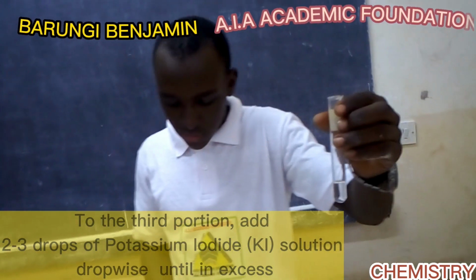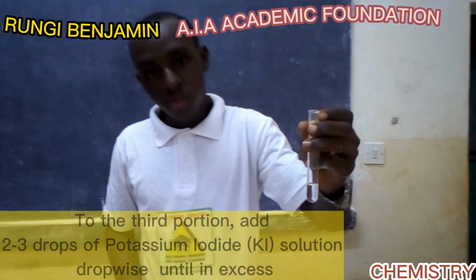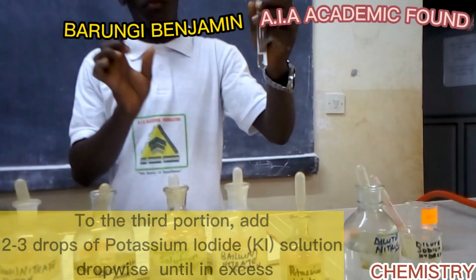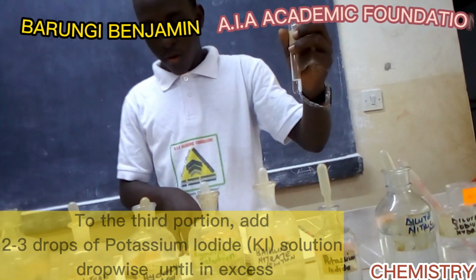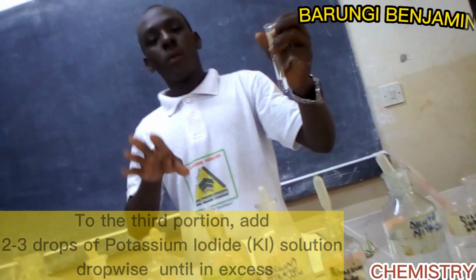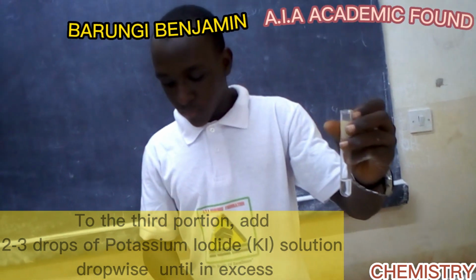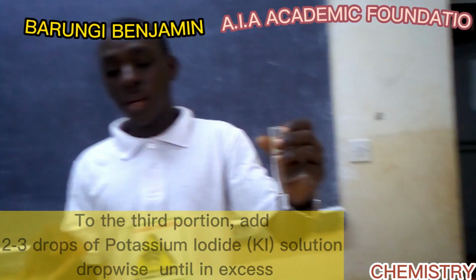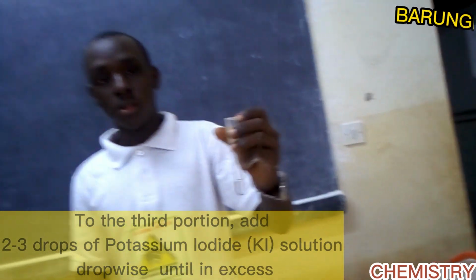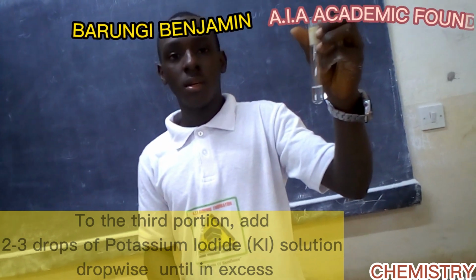We are going to add 2 to 3 drops of potassium iodide solution. Remember, potassium iodide solution reacts with lead 2 ions to form a precipitate, but when it reacts with aluminium 3 ions, it doesn't form one. There is no observable change.